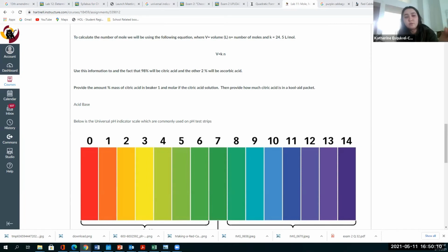For this third one, it went up to above the 35, between the 35 and the 40. Okay, so then you just record it. But that one is going to be slightly off compared to the other two. That's not too bad. If it would have flown over, then I would have said, okay, now what's wrong? I'd repeat it one more time. But that's not too bad. Can I say like a 38? Okay, so then record 38.